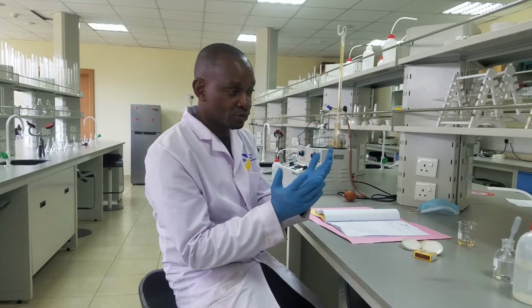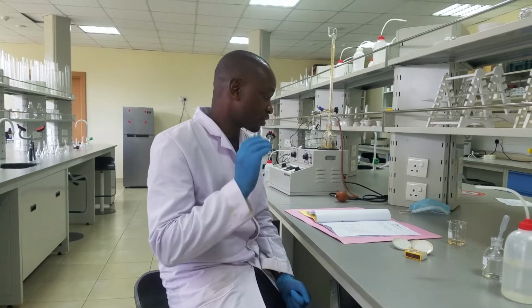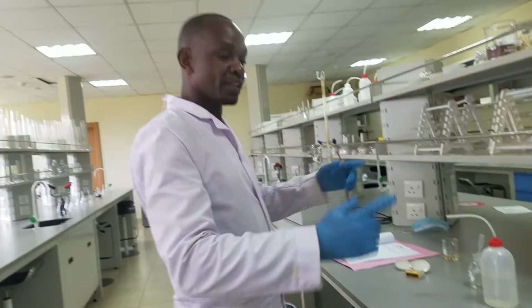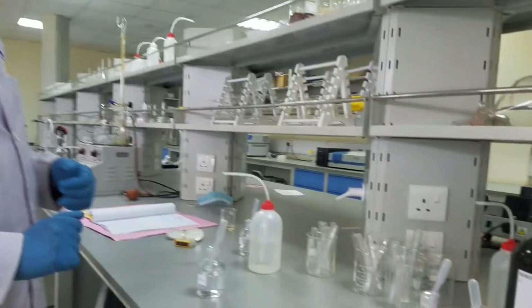So we will make sure that we show you the test tube reaction well for you to make an informed conclusion. I will start with the knowns and finish, and then I will repeat the same process for the unknown.